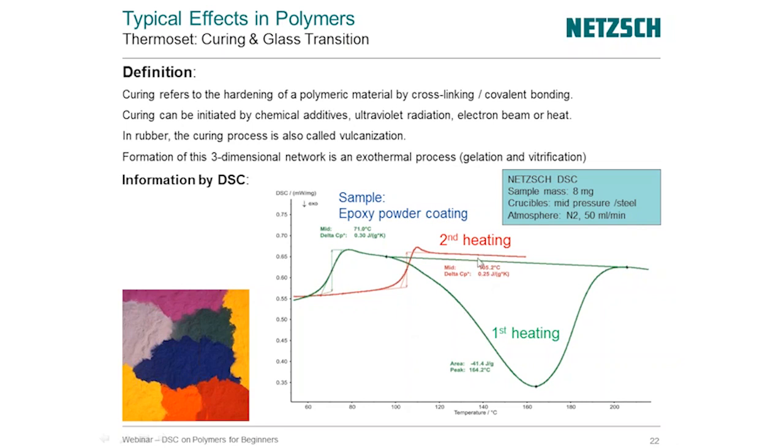But what's also important to comment on is that you'll notice there is no further curing here, right? That means in this first heating, we effectively cured or cross-linked the entire material. So if, for example, we were looking at a composite part and trying to determine if we'd properly cured the material in an autoclave or an oven, then when we heat that material, if we saw any curing after we've processed it, any remaining curing would tell us that maybe we didn't fully cure the material.